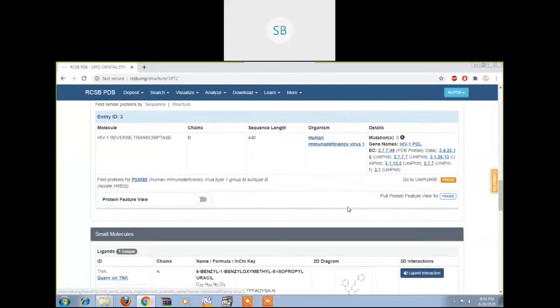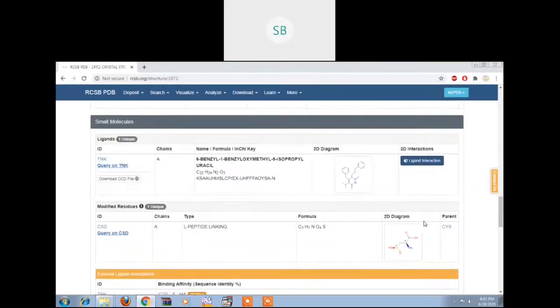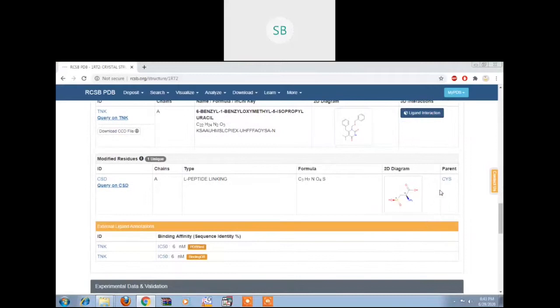So you need to gather those informations pertaining to the active site residues, right? That can also be done. Earlier, the RCSB site provided us this 2D interactions and all, but right now they have just removed this particular thing.